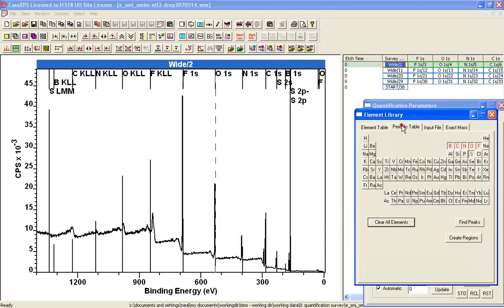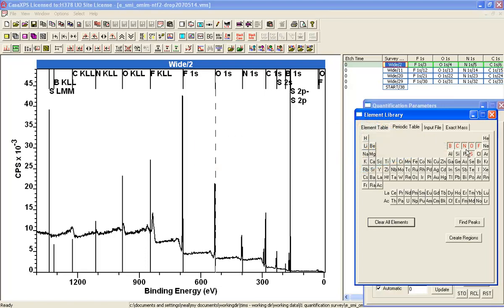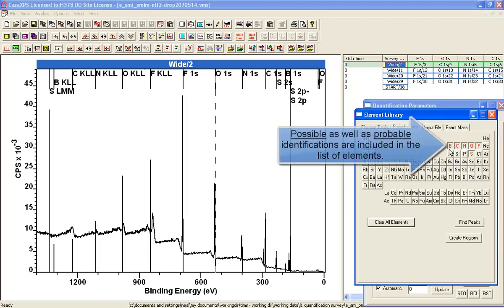And having said find peaks, the elements that are most likely to correspond to these peaks have been identified in the periodic table. But it's also included peaks that are possible, such as this Boron peak.